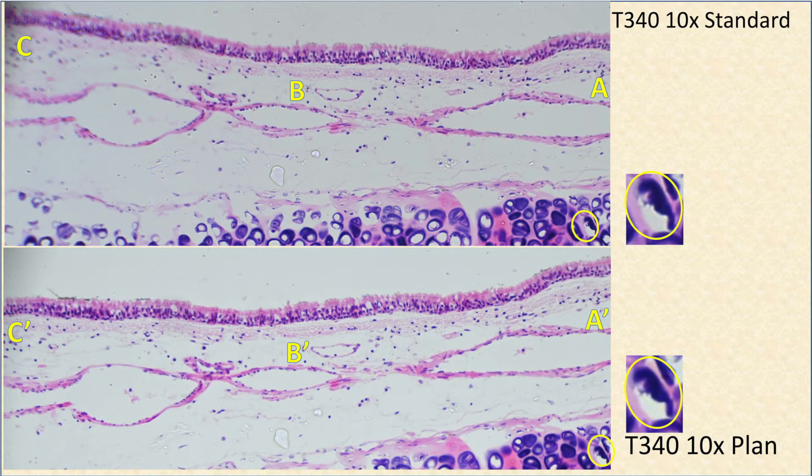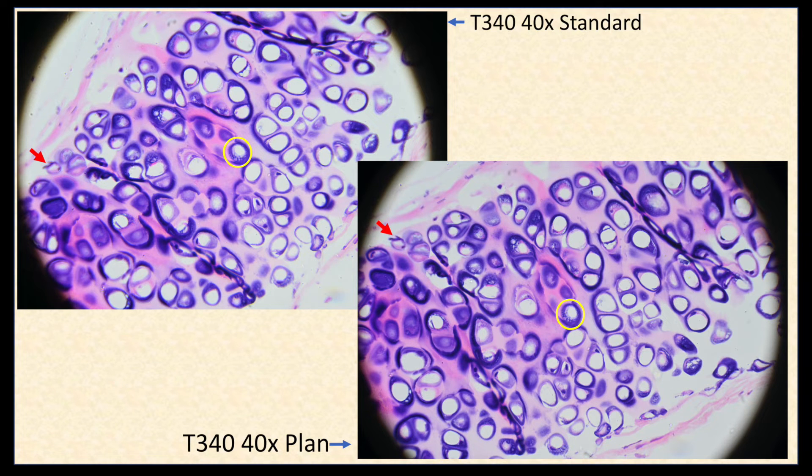Comparing the standard 10x lens with the plan 10x lens, we see once again that the plan lens has a flatter field, but the difference is not as great near the edges as it was with the 4x lenses. And with the 40x objective lens, the performance of the plan lens is only marginally better than the standard lens. I can see differences in areas indicated by the red arrows, but it requires some really close looking.